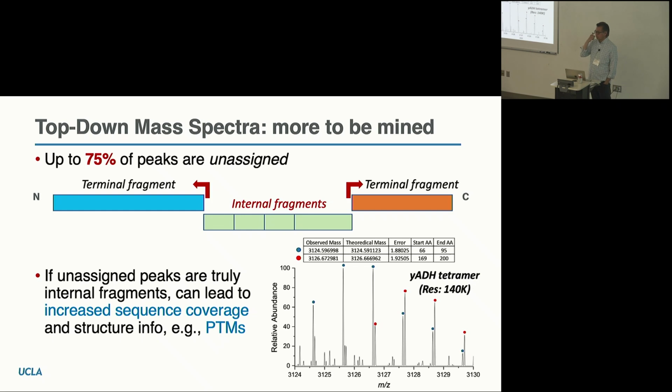Yep. Thank you. For weak protein-protein interactions, could you do some kind of cross-linking before subjecting it to mass spec? You could do chemical cross-linking of a protein or other ligand to your protein or other biomolecule, and then subject that to tandem mass spectrometry. That is possible, but it's experimentally a little bit problematic because it's really hard to get one cross-link from the ligand to the protein. What you're going to get is many cross-links all over the place, and sorting out the right peak that represents the one cross-link you're interested in is a little bit challenging. But people do cross-linking with bottom-up mass spectrometry to get interaction maps that way.